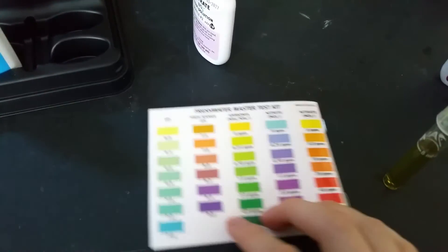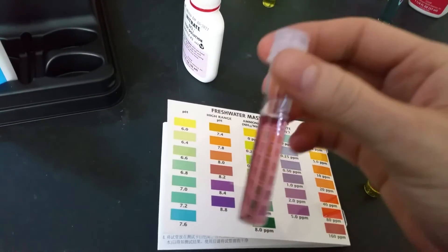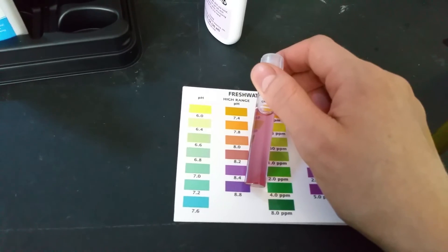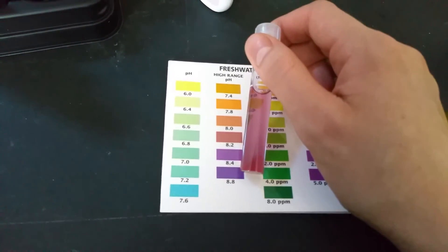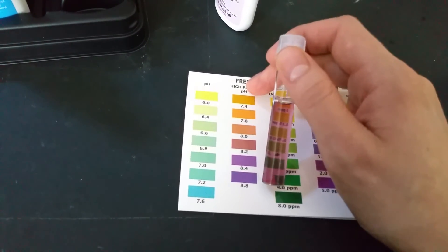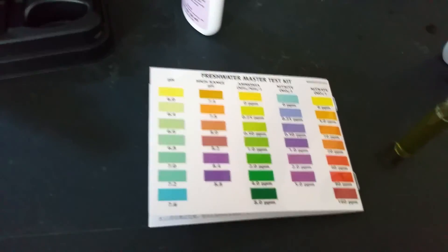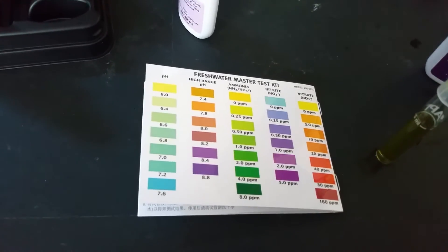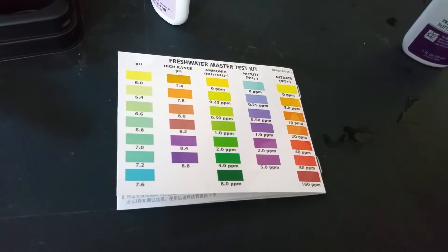Alright, it's been about 5 minutes now. You probably want to be in a pretty bright room when reading results — my room is not so bright right now. Even so, you can see mine is about 8.2 high range pH, going off the color chart. It seems like most people in my town have about 8. Keep your caps on at all times — that's why.